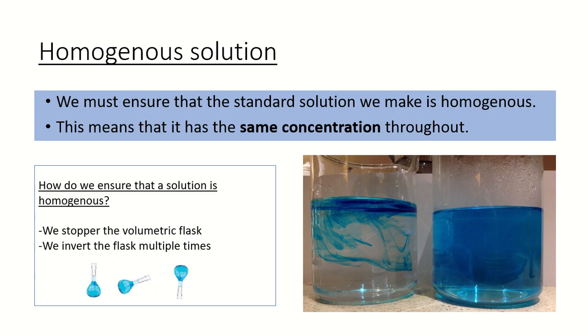Cool. Kind of like the most important step, I think, is we want to make sure that our solution is homogeneous. What does that mean? It means that the concentration is the same throughout. I like to liken it to putting dye in water, food coloring, something like that. So on the bottom right, you can see that image there.